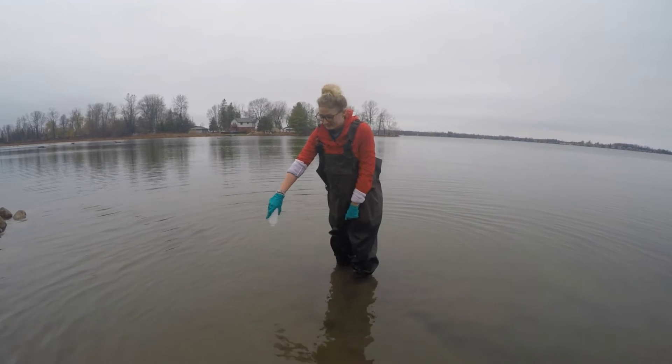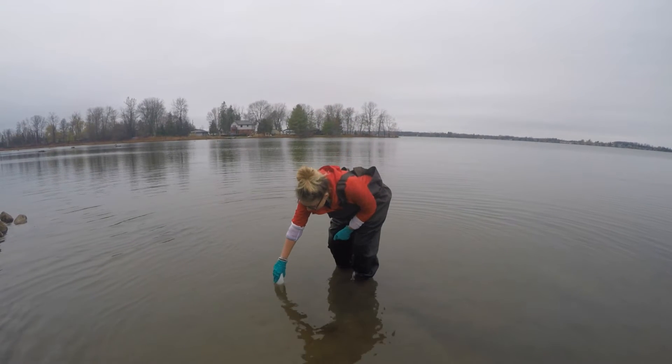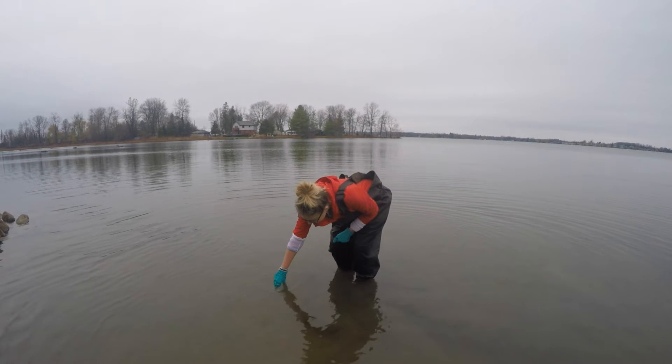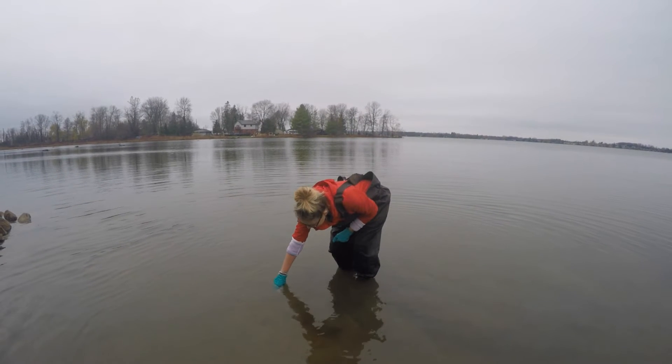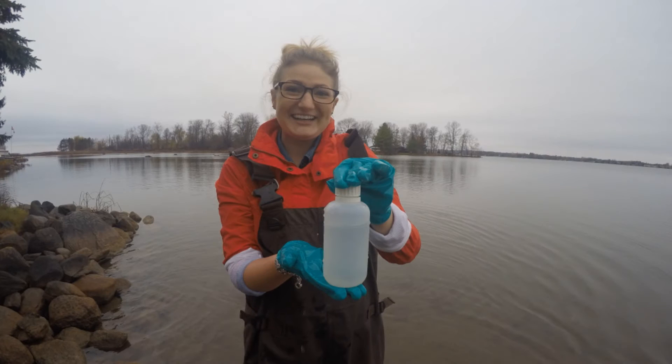Hold the bottle near the base and plunge it neck down to a depth of 15 to 30 centimeters, or to your elbow. Now turn the bottle so the mouth is slightly upwards towards the current. If there is no current, push the bottle forwards.